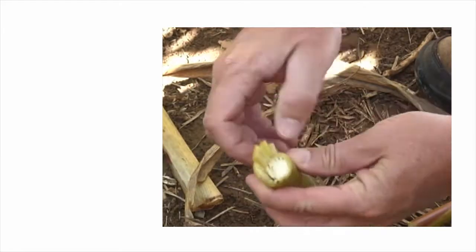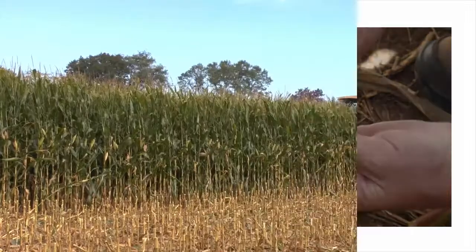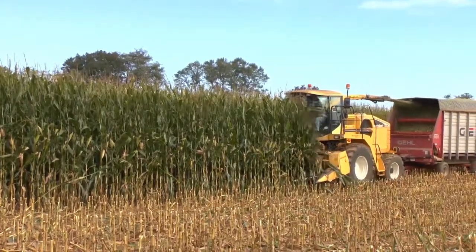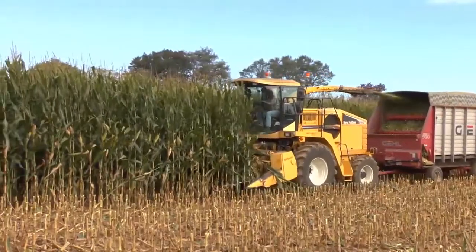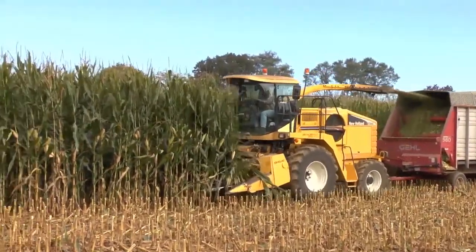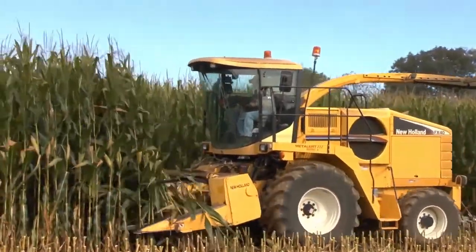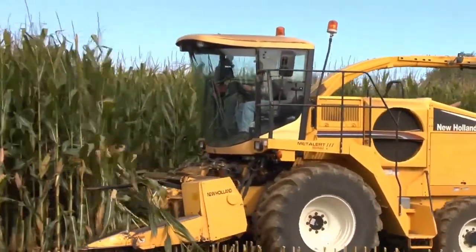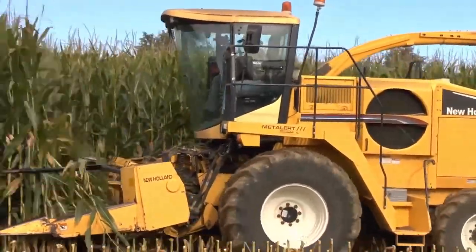Here is an example of a good, healthy, disease-free sample. Experience has shown that cornstalk samples can be taken from fields that have already been harvested for silage, provided that there are a sufficient number of places in the field where the stubble has been left high enough to allow for the specified length of a sample to be cut, and if it is done right after harvest before deterioration of the stalk occurs.